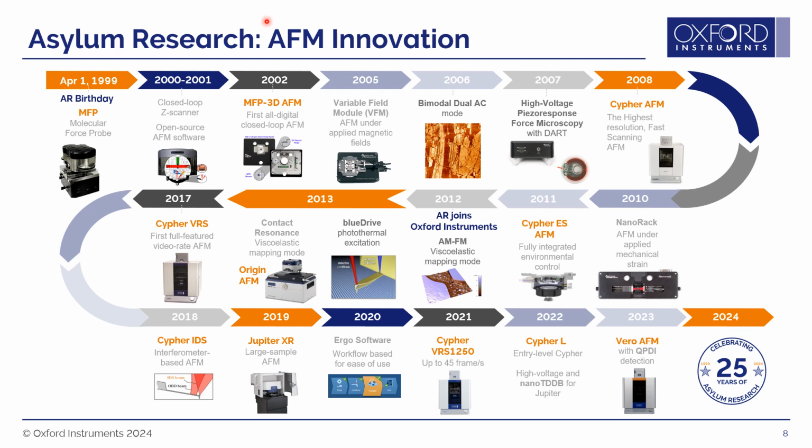In 2013, we developed a technology called blue drive photothermal excitation for improved tapping mode imaging. Tapping mode is the most commonly used AFM mode for measuring topography, and blue drive makes those measurements much simpler and more repeatable, which are important concerns for industrial AFM customers.